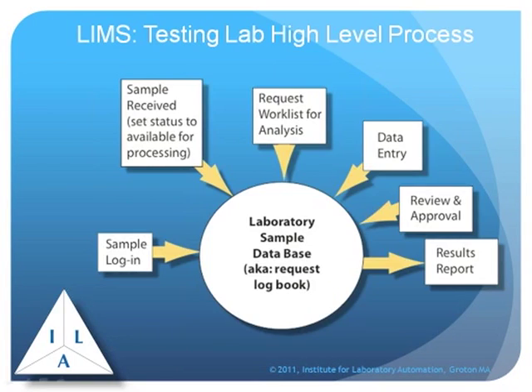For example, laboratory information management systems are built around a process. There's a process that goes on in testing laboratories. It involves the samples being logged in, making sure the samples have been received, the ability to generate work lists. You're going to carry out a certain test that day. You want a list of all the samples that have to be done.